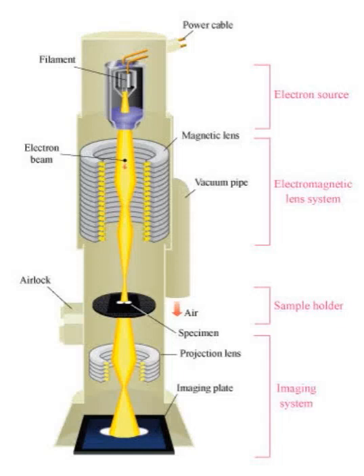Dear student, in this video I am going to talk about the electron microscope, especially the transmission electron microscope. This is a kind of electron microscope. So before that, what is meant by electron microscope?